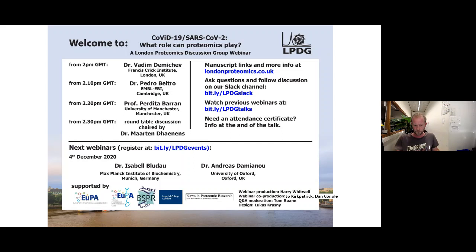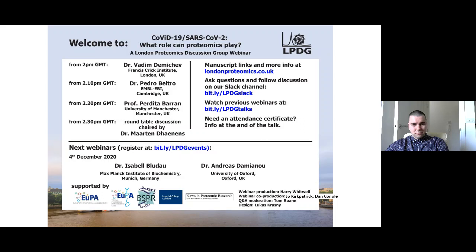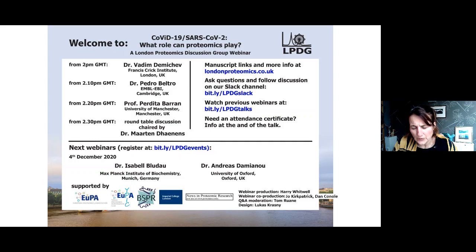So I think the breadth of analysis in mass spectrometry is its strength, as well as its opportunity to be repurposed. But to my mind, at least, I don't have any desire, nor definitely does government, to have a monopoly supplier for any solution. Another way of putting that is what I tell my first year PhD students, which is never be on the edge of tuning space, right? None of us, and for a clinical lab that is just normal, want an assay that is so sensitive to how the sample was collected or how it was transported that it's not robust.